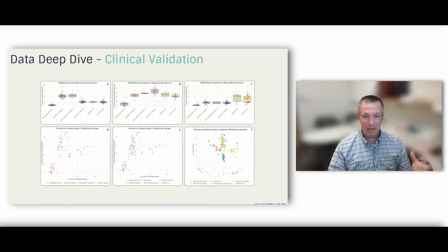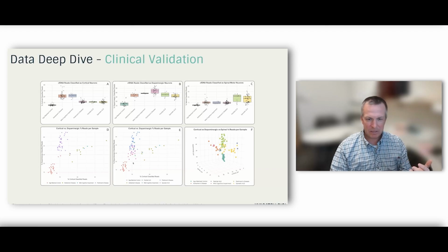So you could take that same idea and even try to plug in a different disease state like ALS. When we did that, still just classifying dopaminergic and cortical neurons, again, those are not the targets for ALS that we would want, but this was trying to discern whether or not this would muddy the waters. And you can see that it kind of does. If we look at sporadic ALS and familial ALS, which are pink and green, you can see them occurring here kind of in the middle. They do cluster, but they cause a little bit of noise. You still get the separation of Alzheimer's and a little bit of Parkinson's and controls, but this addition makes this more difficult.